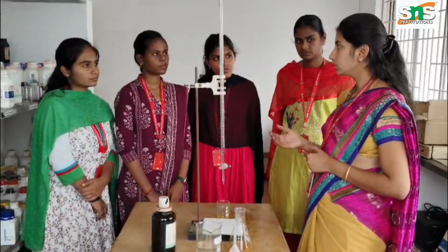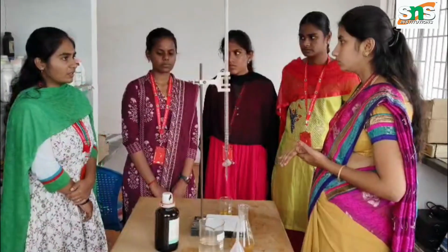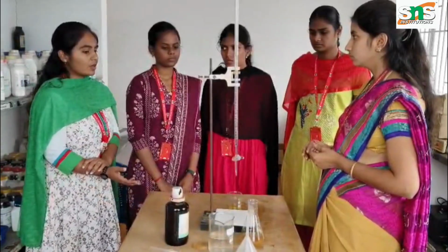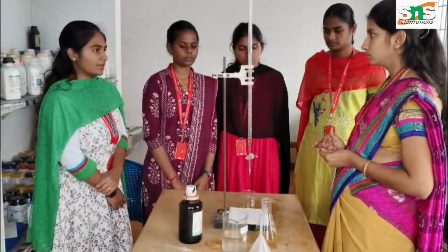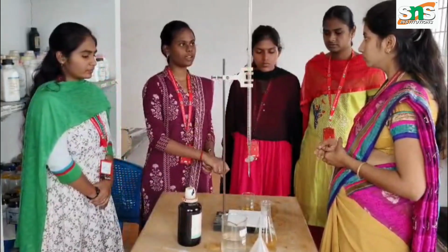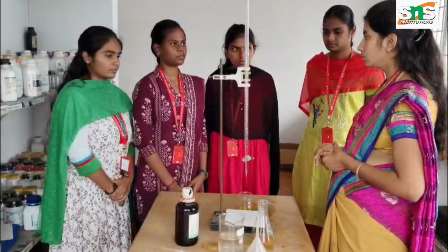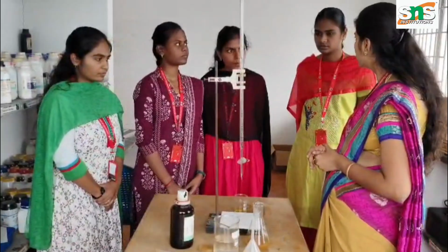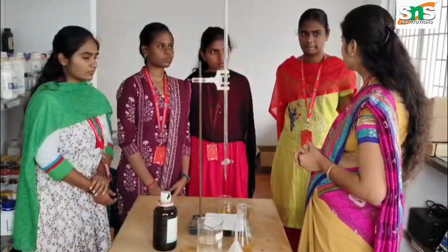So what is the method used in this procedure? Silver nitrate is combined with sodium chloride to get the silver chloride precipitate. Again, adding silver nitrate with the indicator potassium chromate, it will give the reddish brown end point. Next, it is used for the determination of chloride in water for domestic purposes.